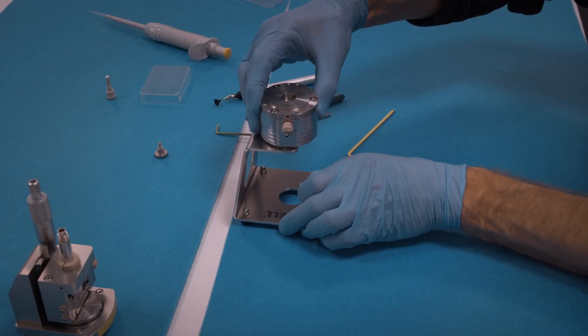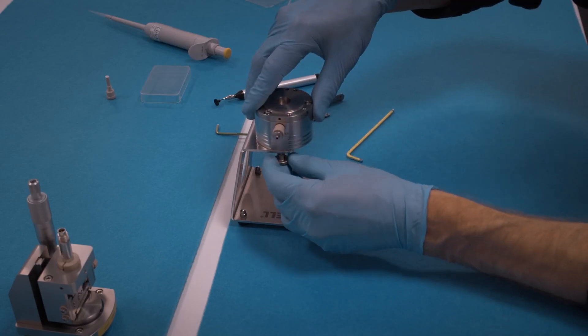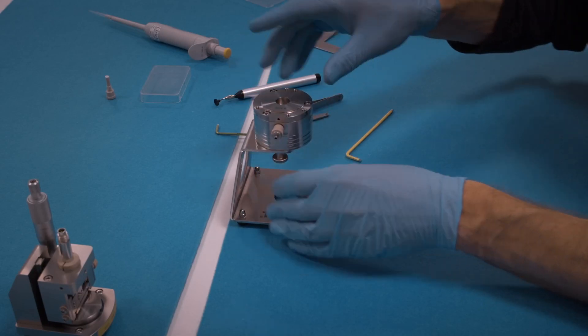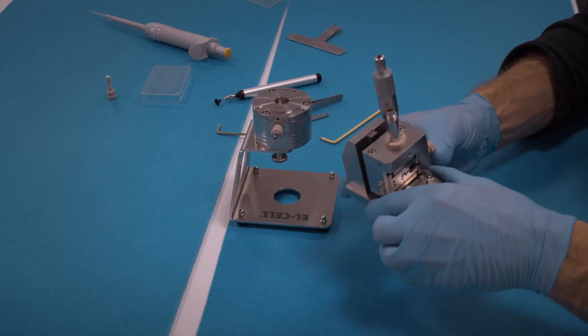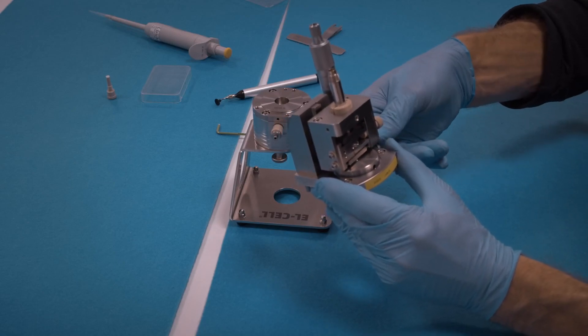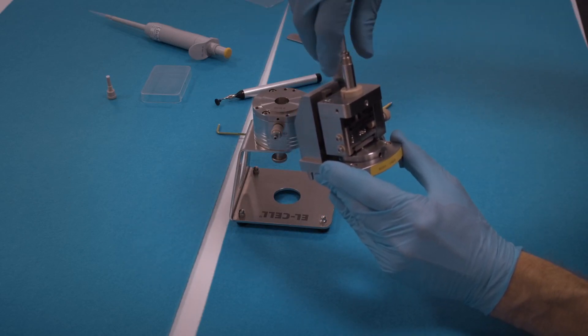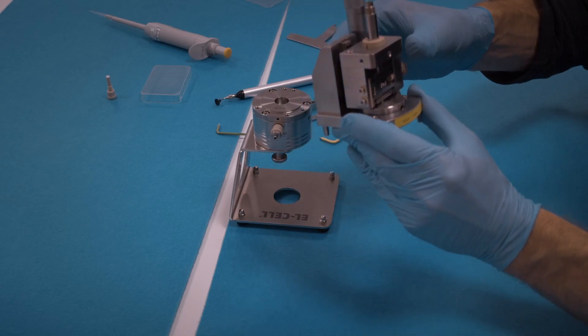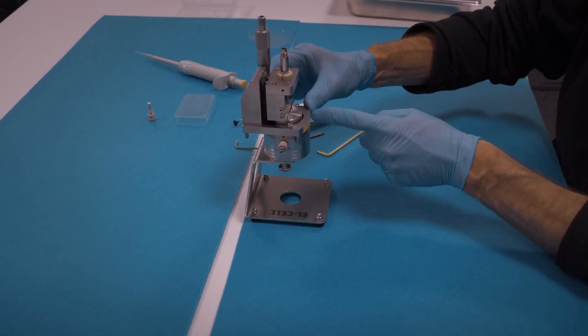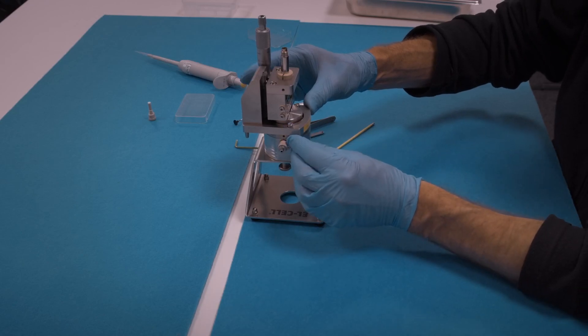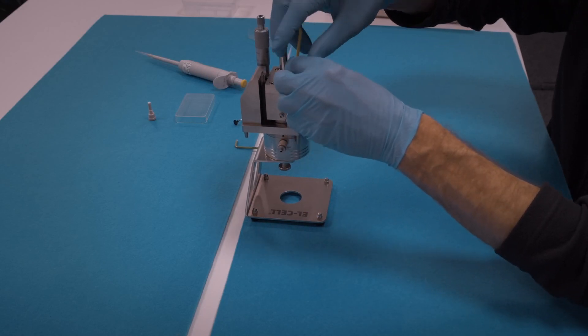Attach the cell to the cell stand. At this point you can remove the cell from the glove box and continue work outside the glove box. We now attach the sensor unit. First make sure that the sensor stage is in the utmost position. Release the stage and bring it up by turning the micrometer screw, then attach on the base. Watch the alignment here in front, and then tighten the screws.